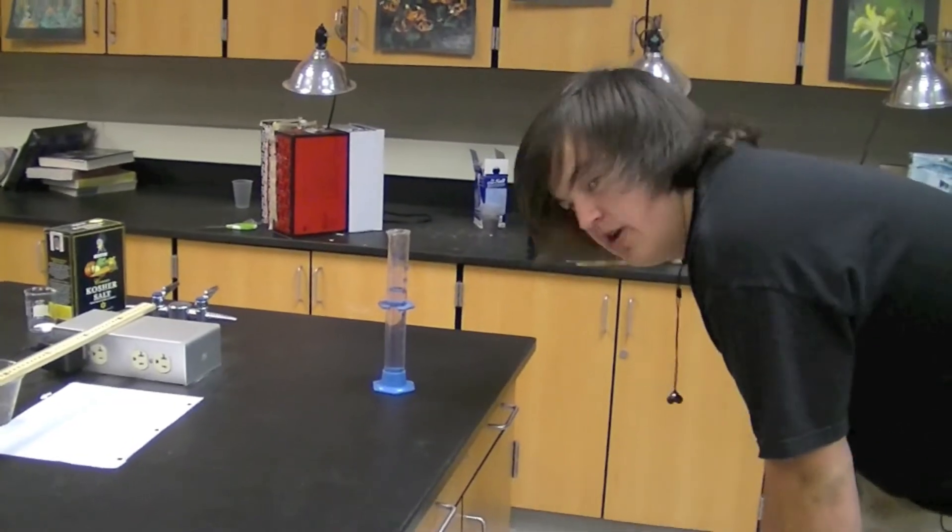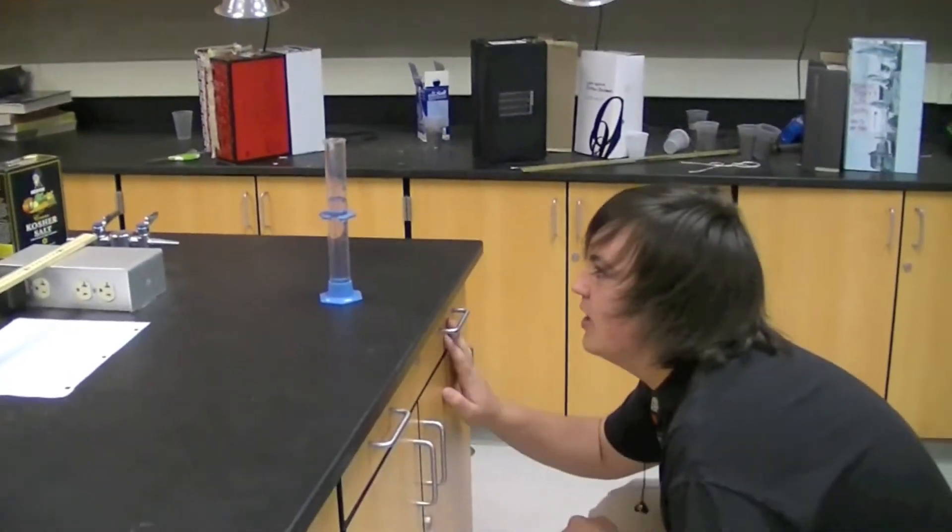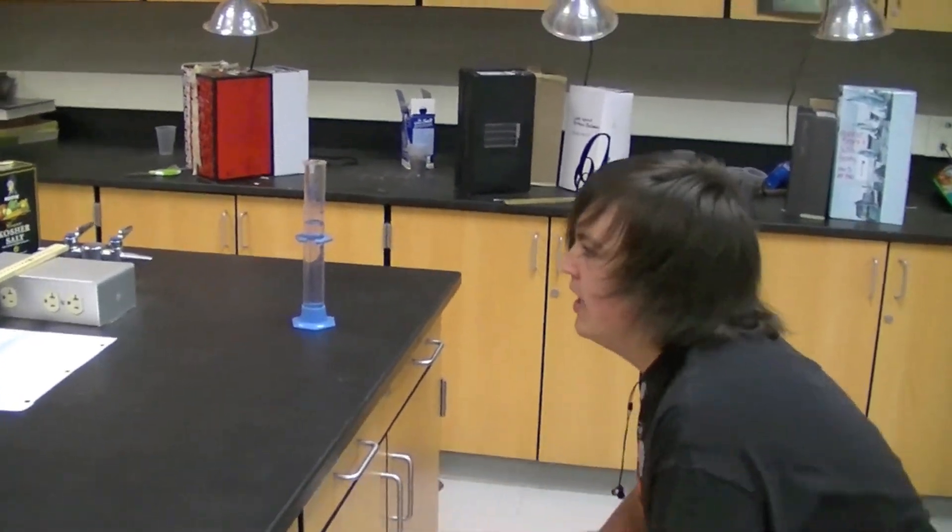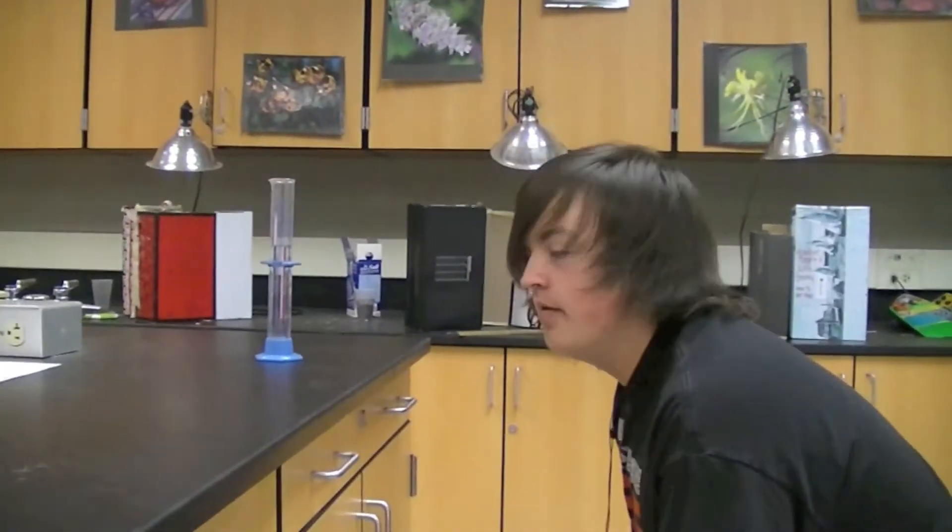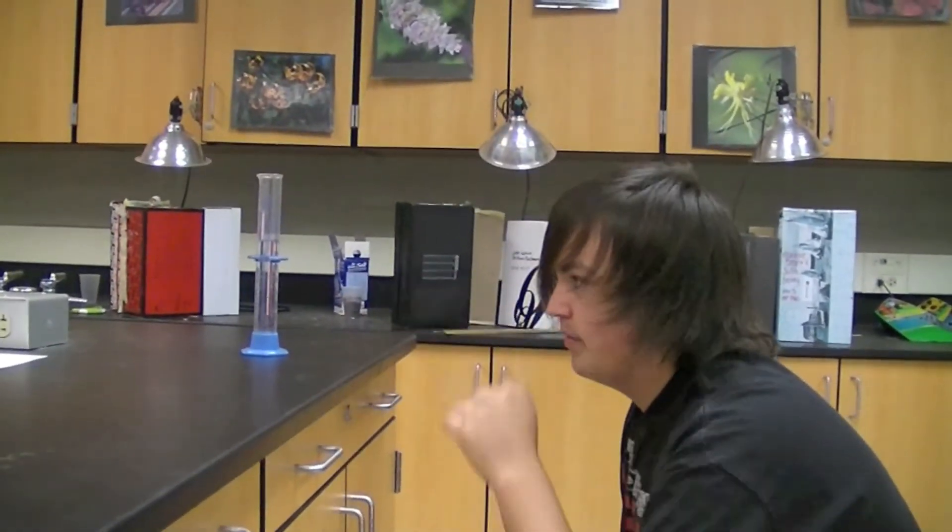So why do I say never to pick it up? Well, here's why. If you're standing here like this trying to read it, or you're sitting down here trying to read it, your measurements are going to be wrong. If you're at eye level right here, you will see it straight through and you will get the proper measurement.